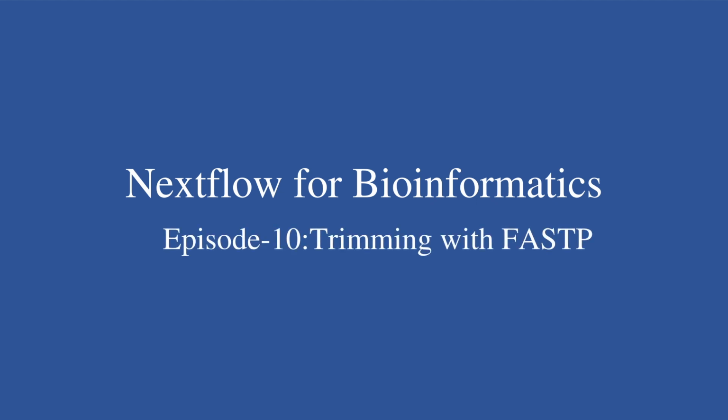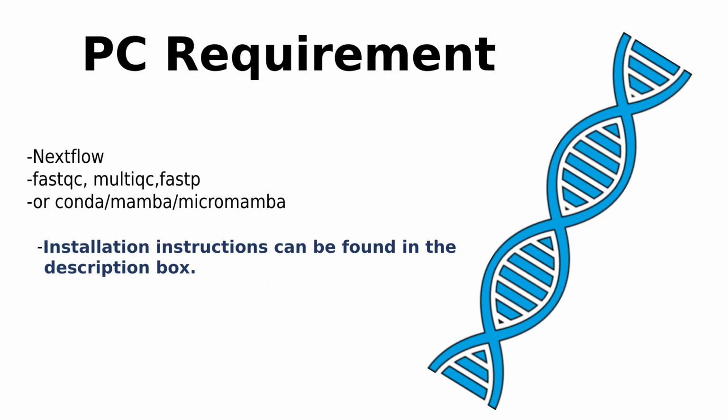For this episode, we are going to write a Nextflow pipeline for trimming. We are going to trim using fastp. Before we start the exercise, we need to make sure we have all the PC requirements satisfied.